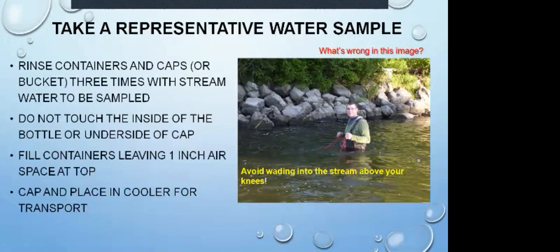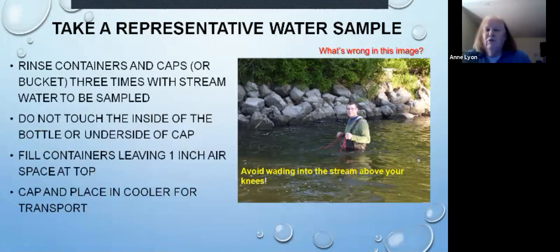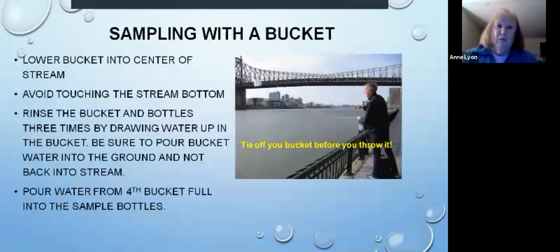Now, what should you do with your cap after you've removed it? I recommend you put it in a pocket and not on the stream bank, because I can't tell you how many people have lost their caps because caps look just like rock. So if you can put it in your pocket and then pull it back out, if you do that, rinse it one more time with your stream water, and then securely put it on the top.